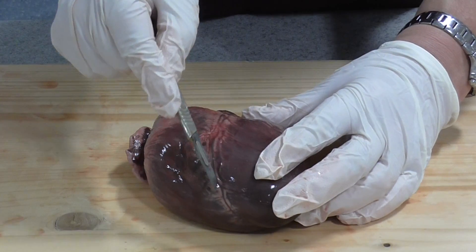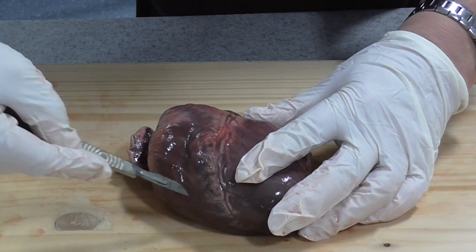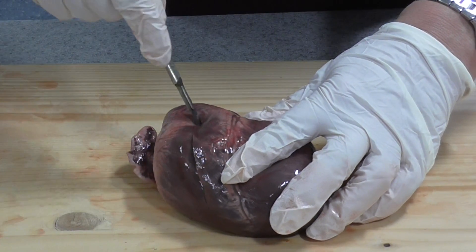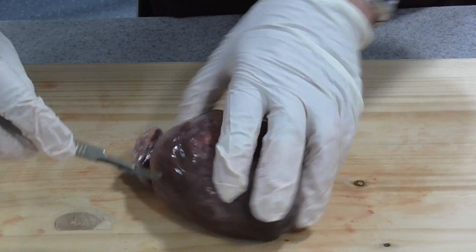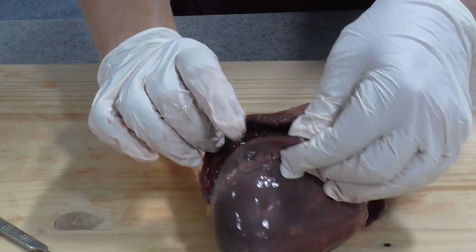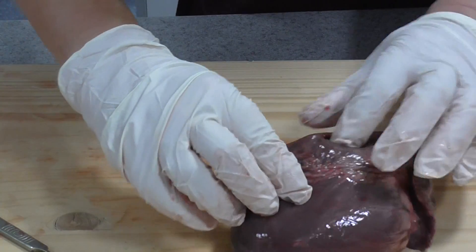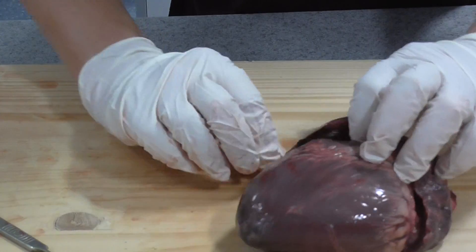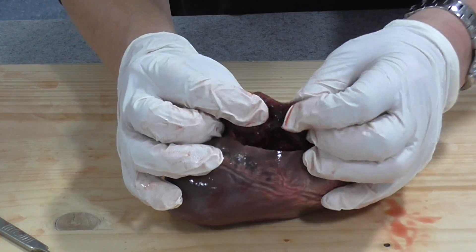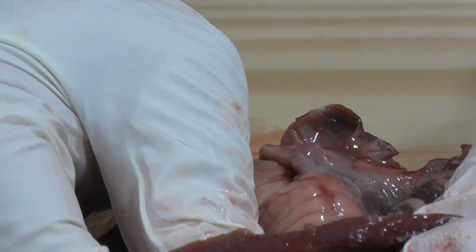We're going to make our first cut parallel to the septum line, cutting up through the wall of the right ventricle, going right to the top and right down to the bottom, then opening out the right ventricle. There are some blood clots in there - not the best heart I've ever seen. The first thing to look at is the thickness of the wall of the right ventricle - I'd say that's about five millimetres of cardiac muscle wall.